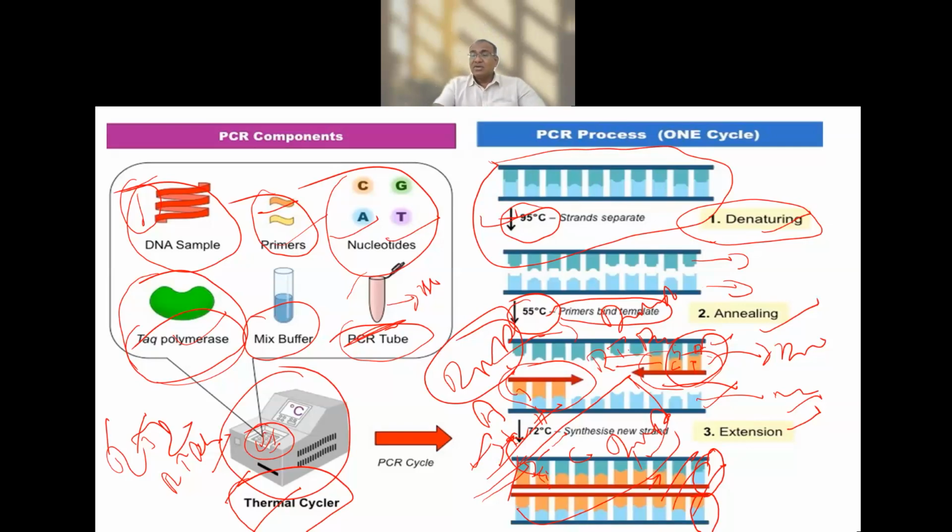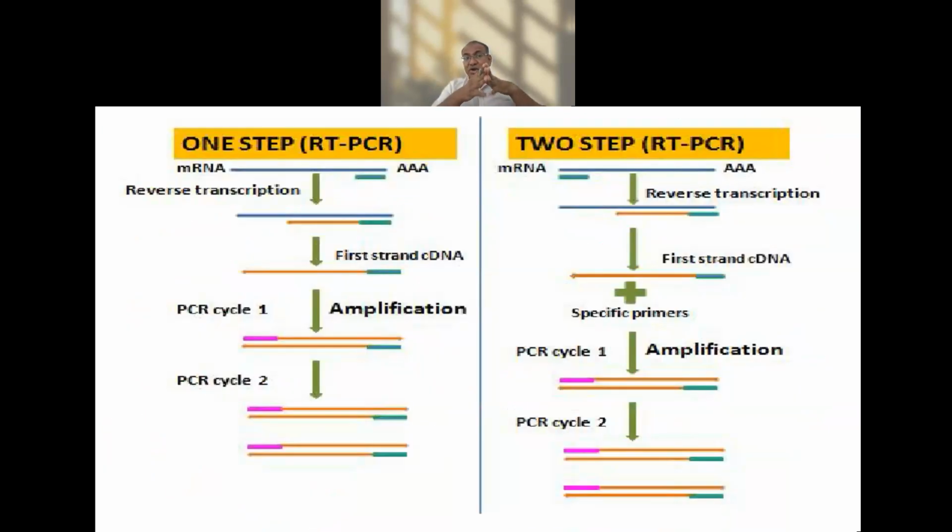Do you have any doubts here, guys, about the components and the PCR process? So here you can see this recorded as one cycle. Okay, that's great. Okay.